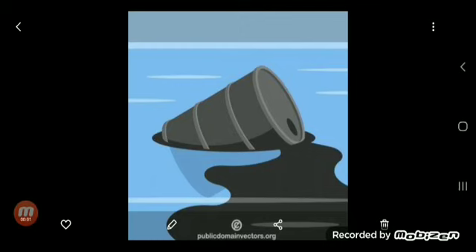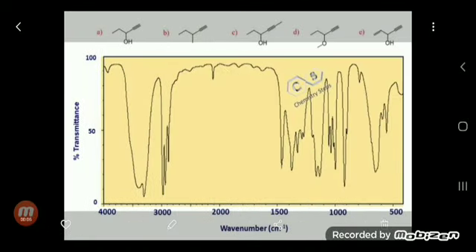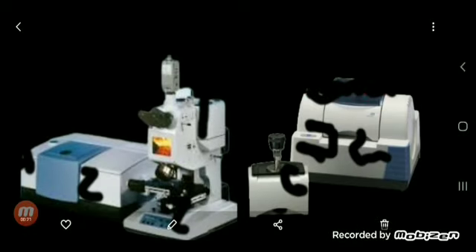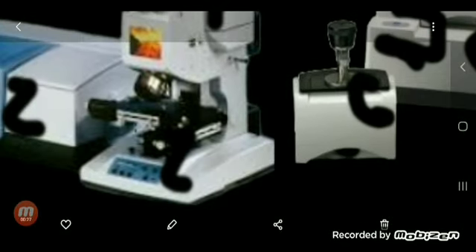So let's start with this cartoon picture or animation for oil and water and move to the spectrum. We call it a spectrum by using the instrument called FTIR, which is this instrument. There are many brands and many accessories. This is called the microscope, which measures for specific applications in microbiology, and also attenuated total reflectance, ATR units. There are some details, but now we'll talk simply about the method for oil and water.